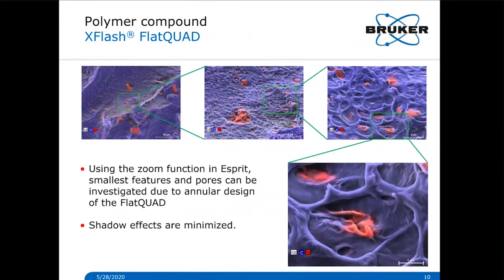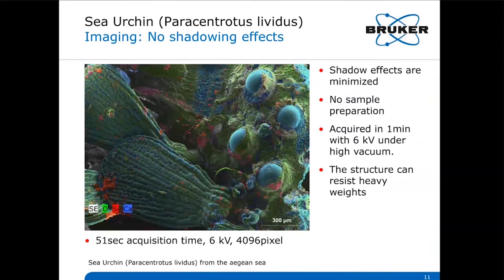The next example demonstrates stronger topography — here is a sea urchin from the Aegean Sea in Greece. It is a beam-sensitive sample with the strongest topography, where sample preparation like carbon coating was excluded, and to avoid charging the sample had to be analyzed with the smallest aperture under low kV. This map of the sea urchin was acquired in less than a minute under high vacuum at 6 kV. Tubercles are visible in turquoise on the right, while the green and turquoise spade-like structures on the left are minuscule spines. Individual sand grains are visible in red, and shadow effects are minimized nearly to zero.